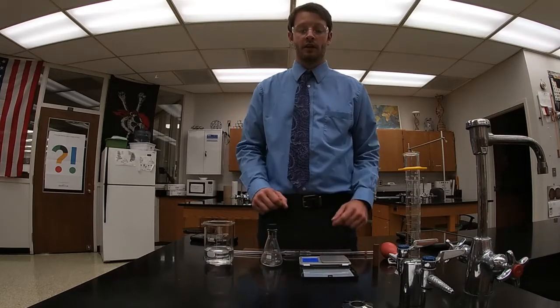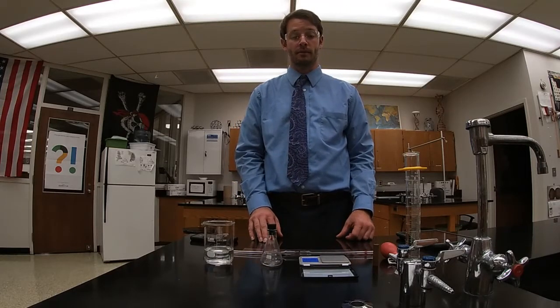Take it off. Using those four masses, you should be able to calculate the mean.